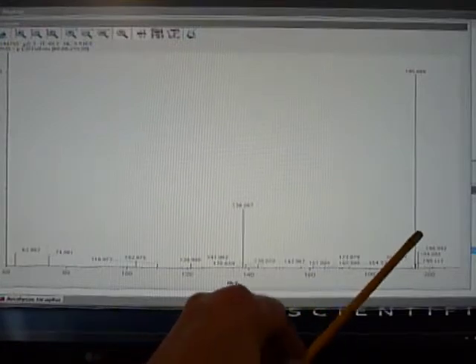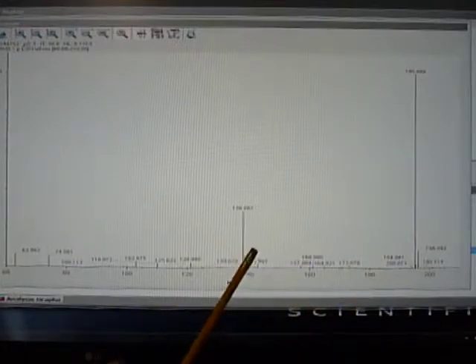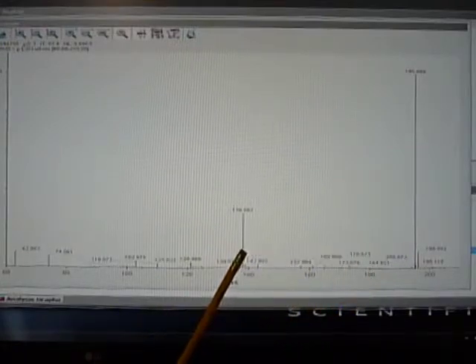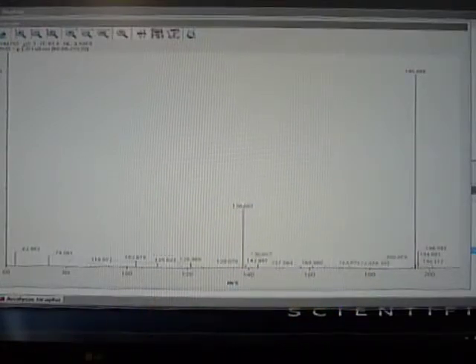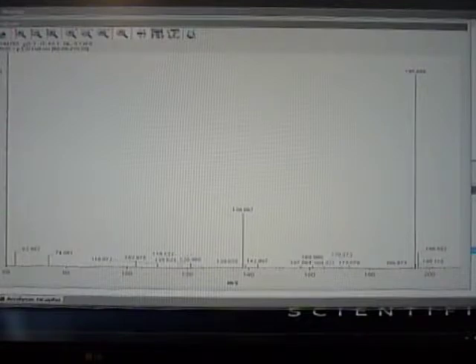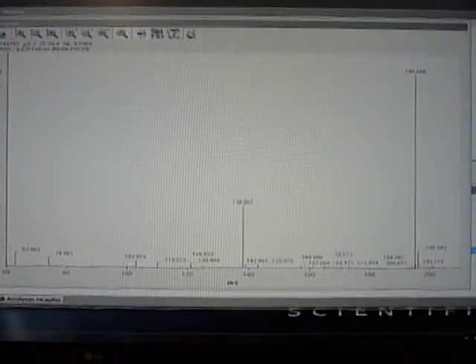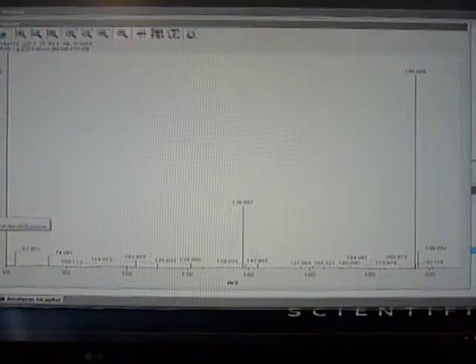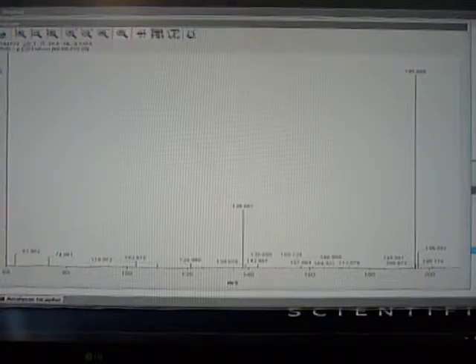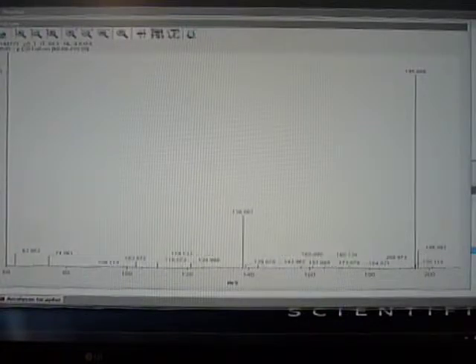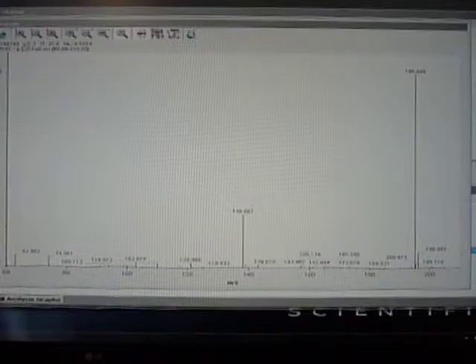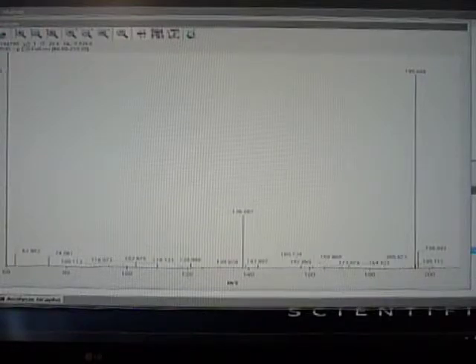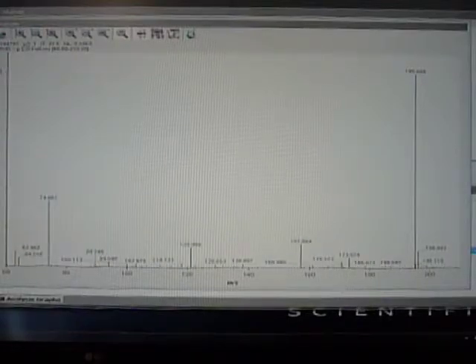Still have our M plus 1, and now we have a fragment of caffeine. Let me take the skimmer voltage back to 20. And the fragment drops back.